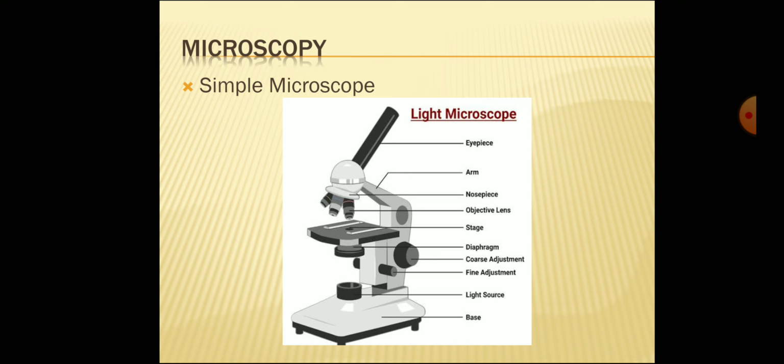The image is then magnified by the second lens known as the ocular or eyepiece as it is brought to the eye. A microscope has a light source and condenser. The condenser is a lens system that focuses the light from the source on a small bright spot of the specimen. Microscopes have interchangeable objective lenses and fixed eyepieces.